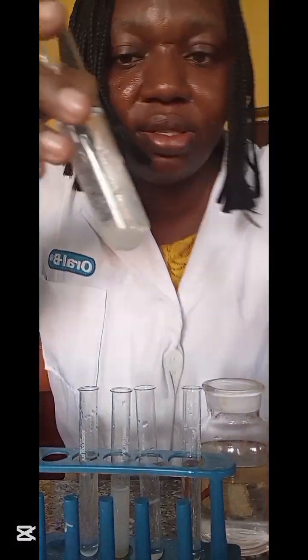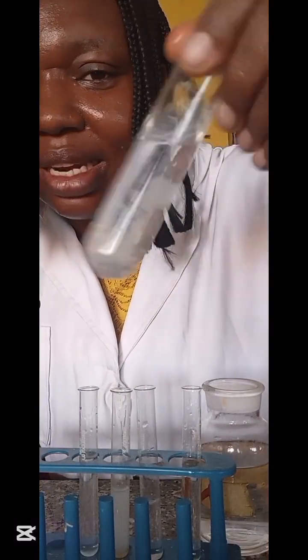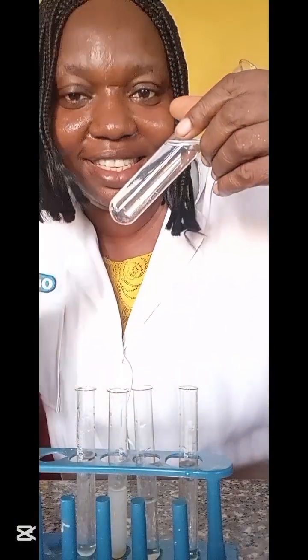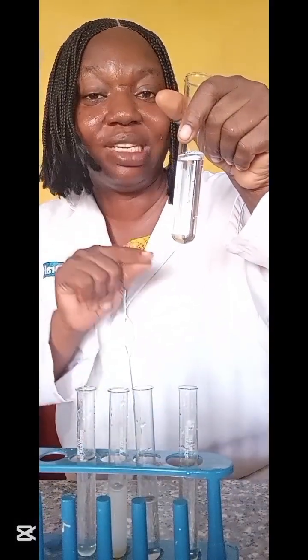Then excess ammonia. You see it's clearing up. There's a reason why they said excess. You begin to shake it. As you can see, it has dissolved. So that is telling us that this is zinc. It is soluble in excess sodium hydroxide, also soluble in excess ammonia.